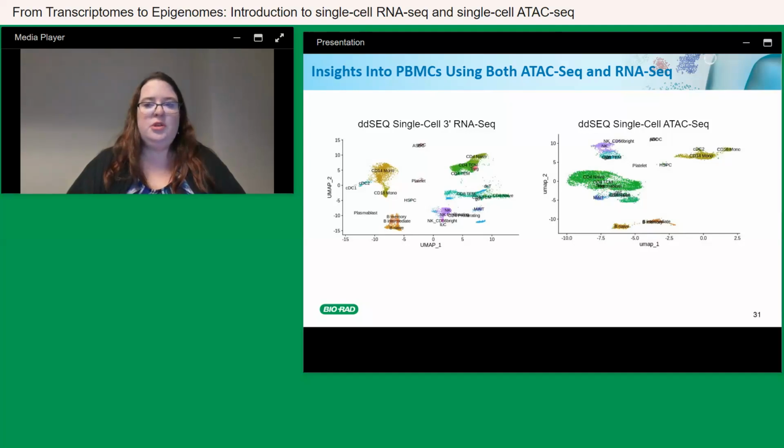After quality control was performed, we were able to perform cell type annotation, including cell types that were found in both samples, such as B cells, T cells, natural killer cells, and monocytes. With this multi-omic data, we can look for differential accessible peaks and differential gene expression that suggest a genomic relationship between a gene in a particular cell type, or of genes where the differential gene expression is not due to the changes in the gene's accessible chromatin.